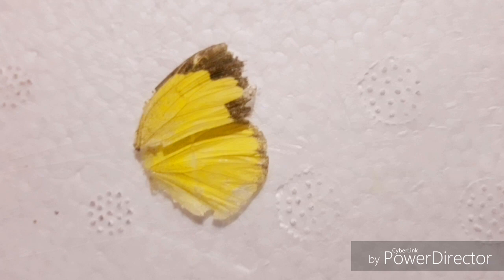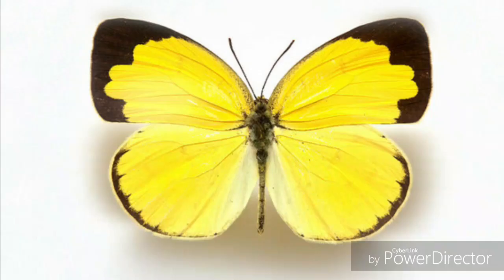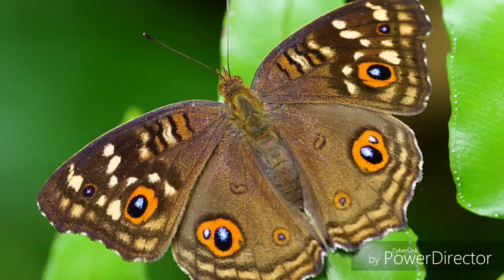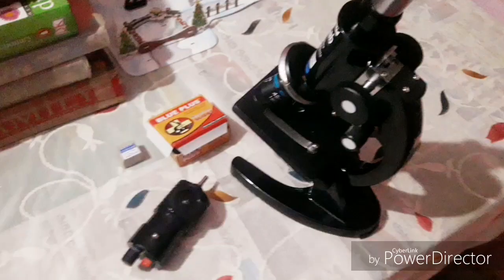First, I have the right pair of wings of Common Grass Yellow, that is Eurema hecabe, which is a small bright yellow colored butterfly belonging to the family Pieridae. The second sample I have is the right fore wing of the Lemon Pansy, that is Junonia lemonias, belonging to the family Nymphalidae.